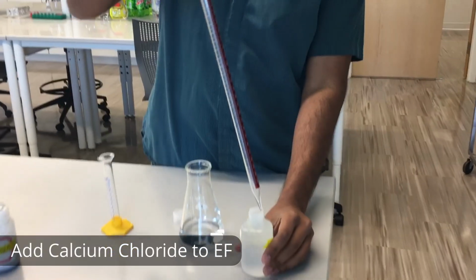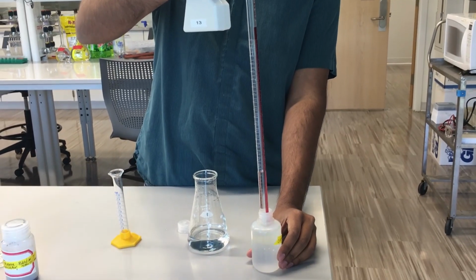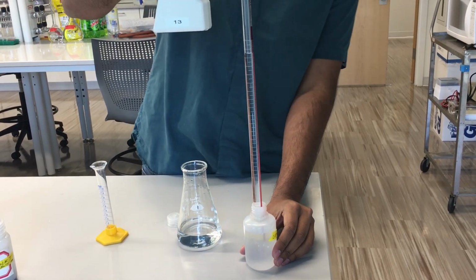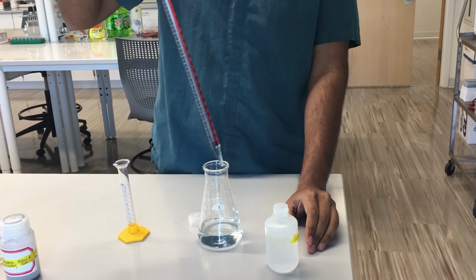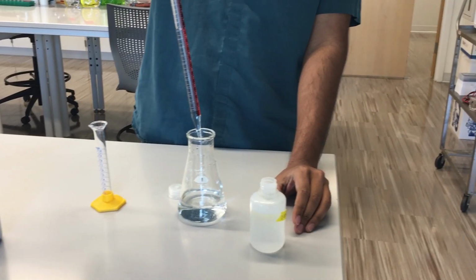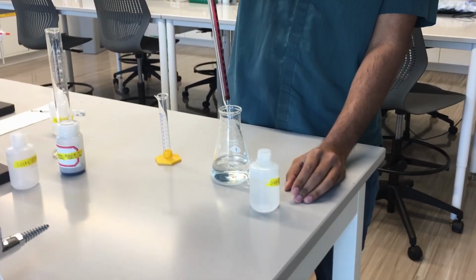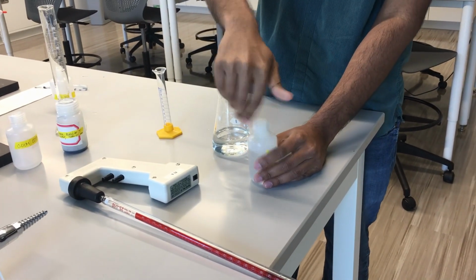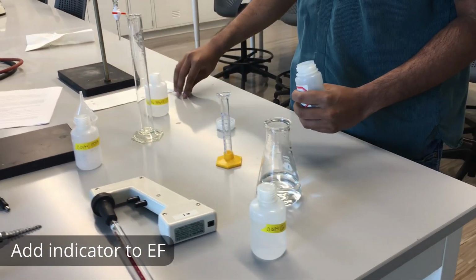And to that, we'll add some of our standardized calcium solution. This standardized calcium solution has a known concentration of calcium. We'll use this to help us figure out the unknown concentration of the EDTA solution. So we'll add all 25 milliliters to our Erlenmeyer flask here. And we'll go ahead and add about 10 drops of our indicator.